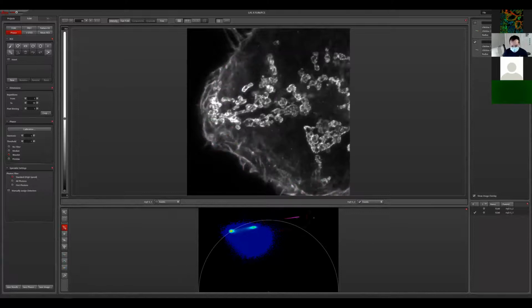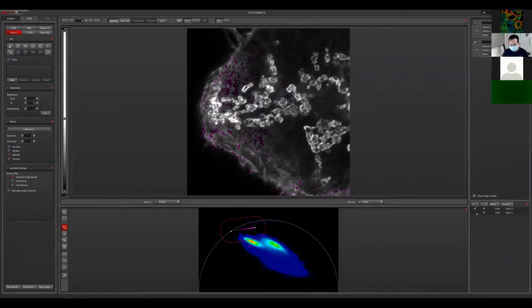For the STED image, things are going to be a little bit more complicated, because so far what we had always is just the distribution over two points, as you can see here. We had one dye with one lifetime, the other dye with the other lifetime, and then we can just, with a line, easily separate them. But now instead, we have, if I may say, a third component that influences our lifetime, that is the STED laser.